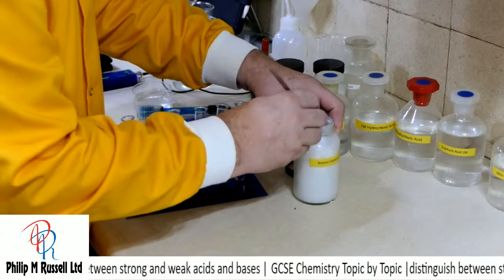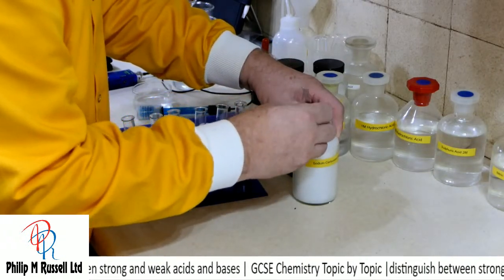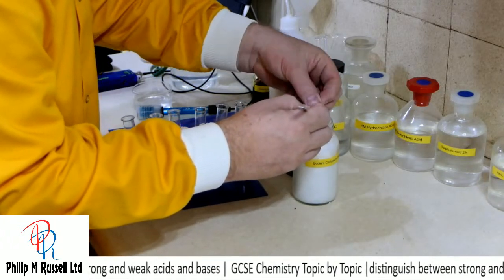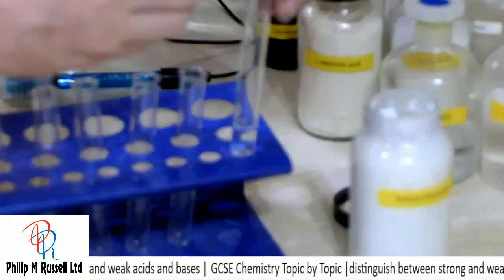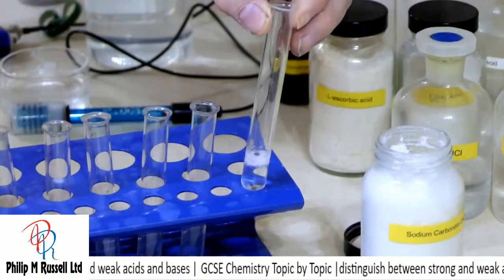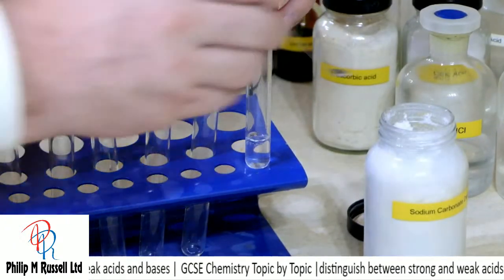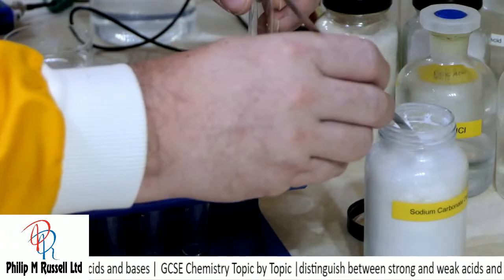And what I'm going to do is put a small amount in there. Ready? Here we go. Well, that reacted virtually instantly, didn't it? Let's put another little bit in there.